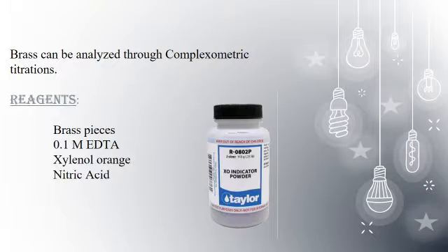This analysis is done through complexometric titrations, and the reagents used for this are the pieces of brass, 0.1 molar EDTA solution, the xylenol orange indicator shown here, and nitric acid solution.